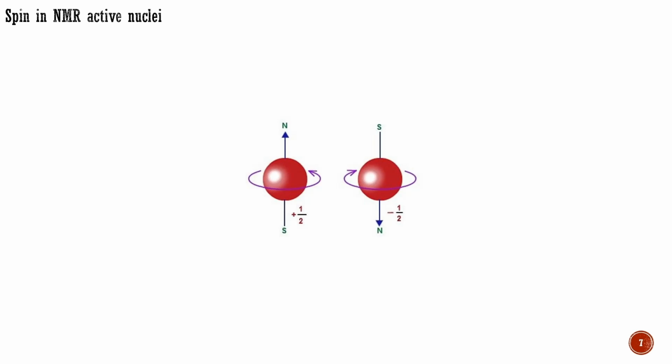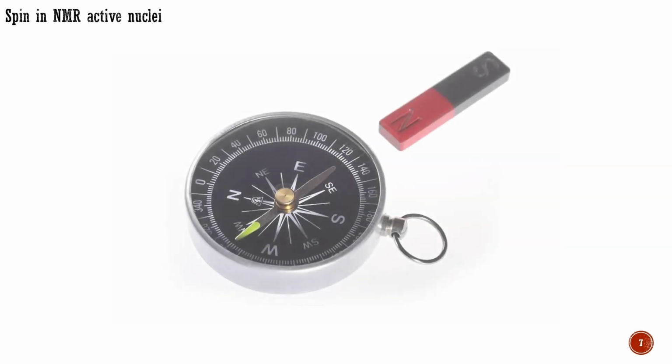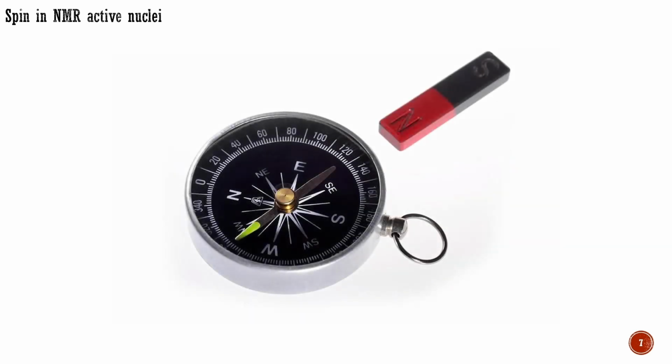If you conceive of a carbon-13 and hydrogen-1 nucleus spinning, you can see how the nucleus can point in one direction. It is the axis of the spin that is aligned with, or against the field. Let us return to the compass for a moment. If you want to move a compass needle away from pointing north, you must push it and expend energy as you do so. If you put the compass next to a bar magnet, the attraction towards the magnet is much greater than the attraction towards the North Pole, and the needle now will point at the magnet. You also must push much harder to move the needle from the magnet.